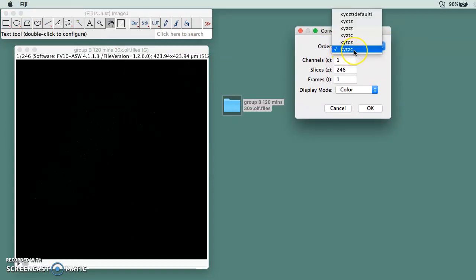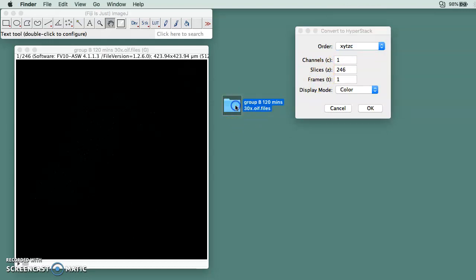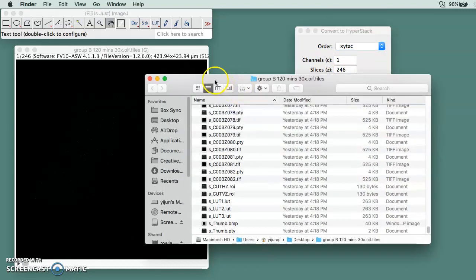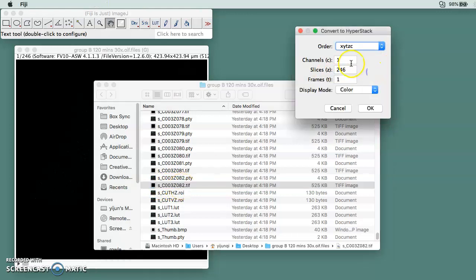For the channel, slice, and frame, you open your folder and look at the last image you took, which for me is C003 Z082. So your channel has three channels for three different colors, your slice is 82, and frame is 1.